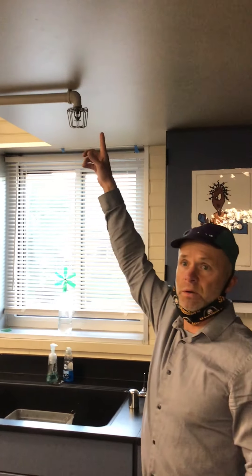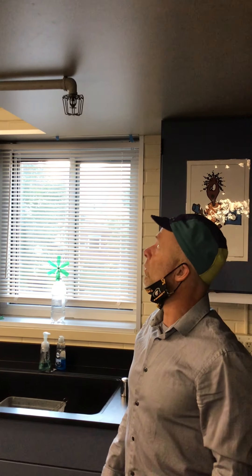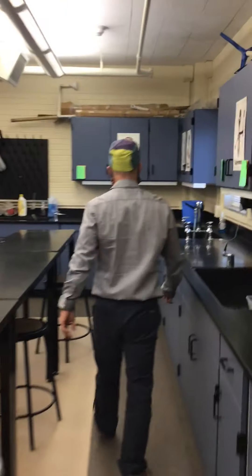These here are water sprinklers. If there's a fire, these water sprinklers will be triggered and we'll have basically a lot of water coming out of one of those sprinklers.